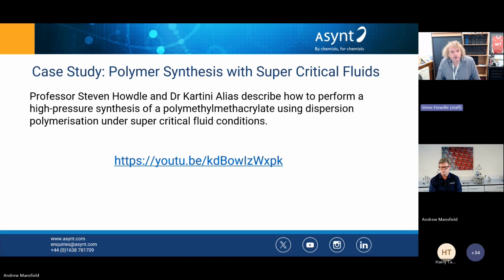But I've been involved in visiting people around the world, and I've seen some really large high pressure kits. So, for example, in southern France, northern Spain, and Portugal, there are very large supercritical fluid apparatus that are there to clean up cork wood. So the wood that's used to form a cork in a bottle of wine, and they use supercritical CO2 to do that.